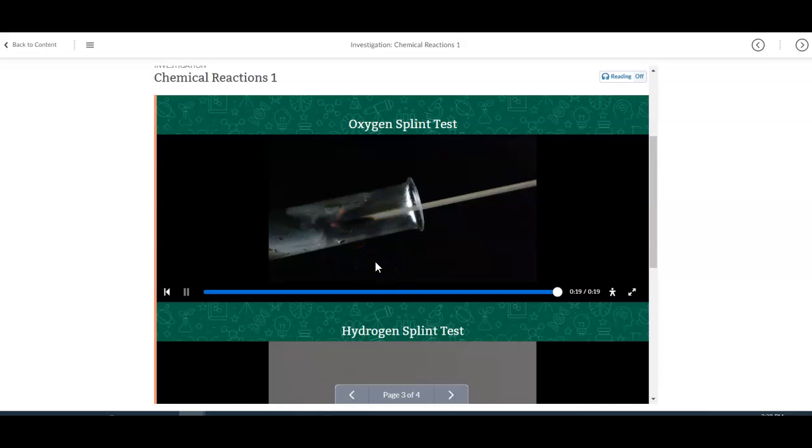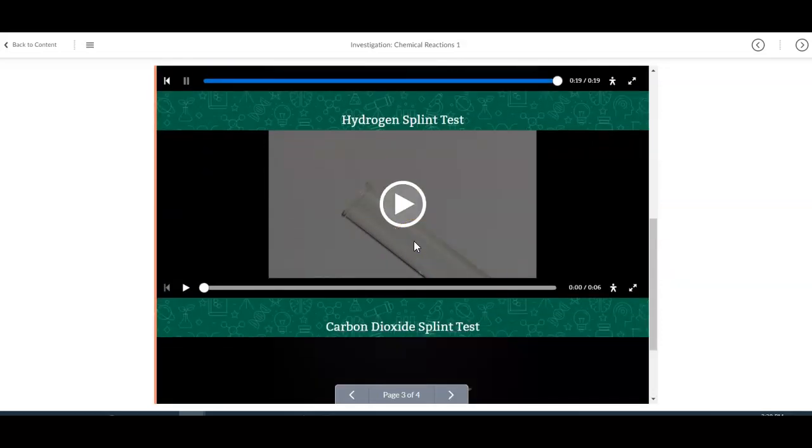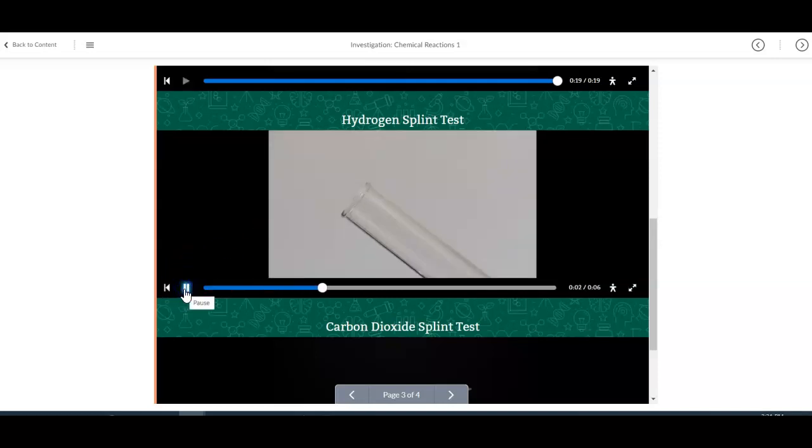That's what we saw. Okay, the next one, hydrogen, is a little bit misleading. So let's see what happens here. Hydrogen gas is highly reactive as well. It's in the periodic table group 1, and those are highly reactive. Let's take a look and see what happens here. All right, we're able to see that as soon as it comes near the hydrogen, the flame is extinguished.